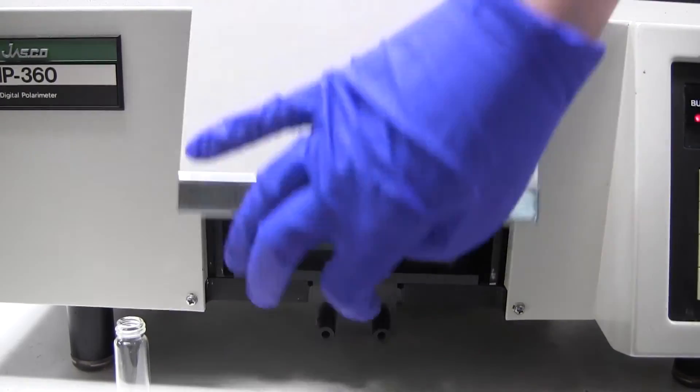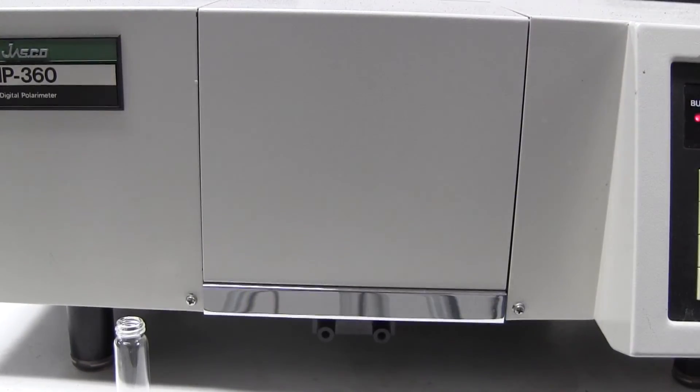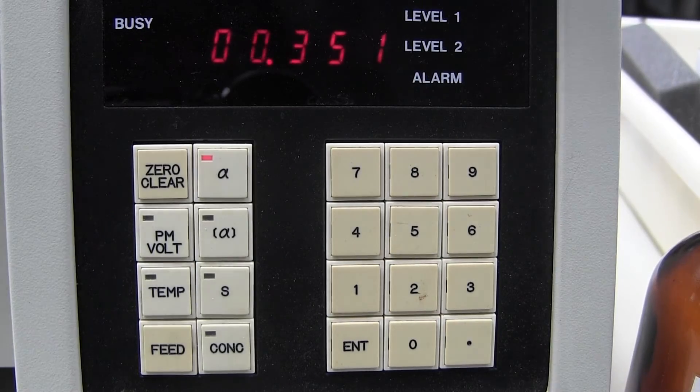Close the cover and wait for the readout to become constant. Record this amount. Remove the cell and close the door.